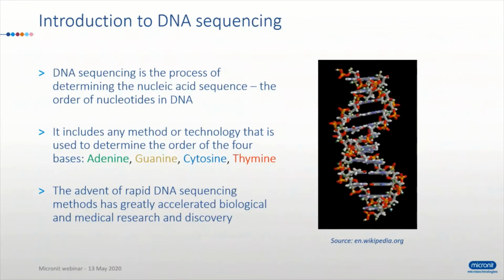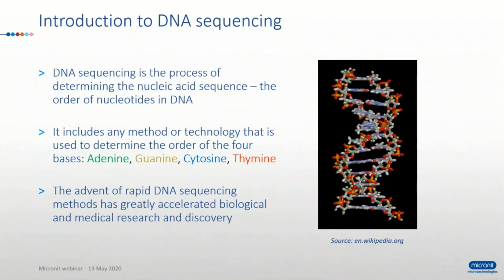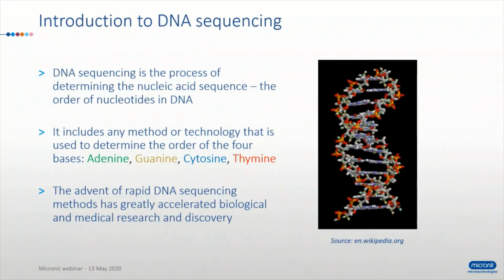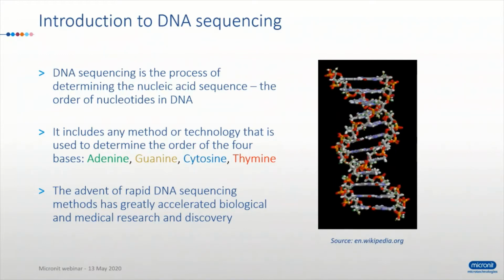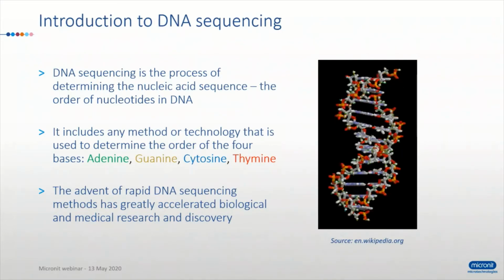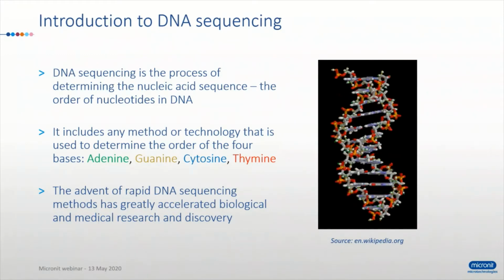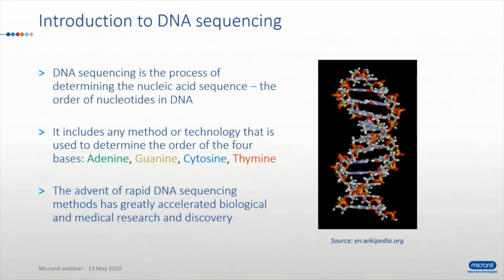For those of you who are less familiar with DNA sequencing technology, I've prepared a few slides to give you a little bit of insight in how this works. To be clear, I'm not a biologist, I'm a technologist, but I've used some public resources to make it simple and to make sure that this kind of information can be shared and also accessed by you in case you're interested. DNA sequencing is the process of determining the nucleic acid sequence. I think that's all known to you.